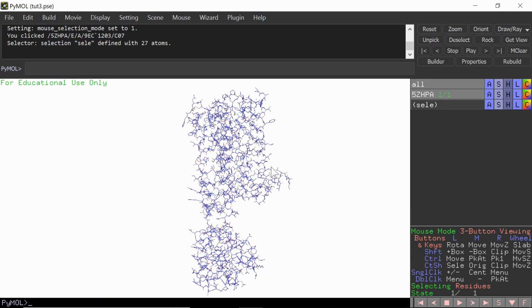Similar to sticks, using lines to represent the entire structure or even large parts of the structure is not advised, as it's very hard to see any of the detail. It gets lost in the mess of all the lines.